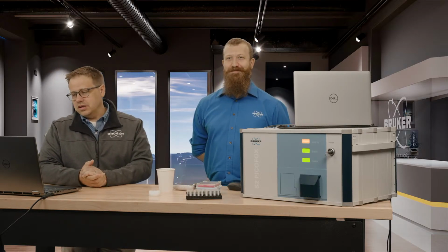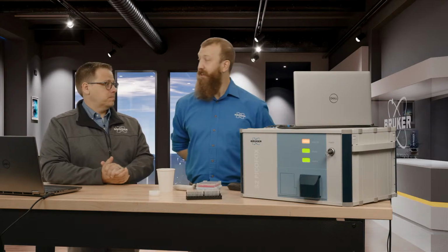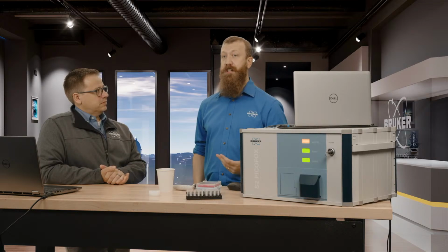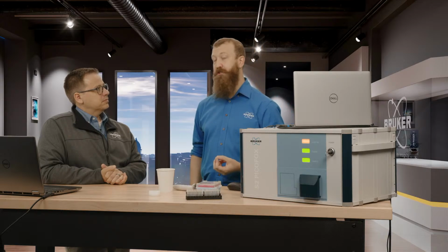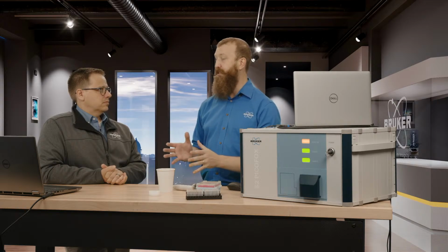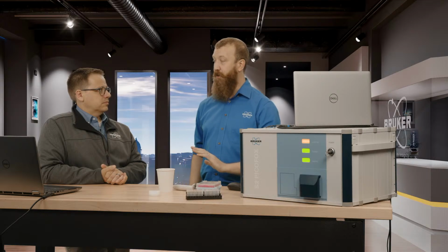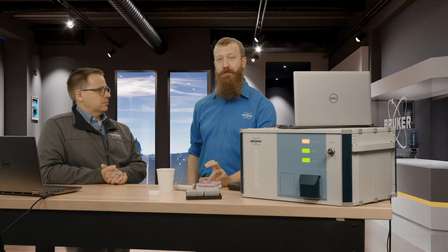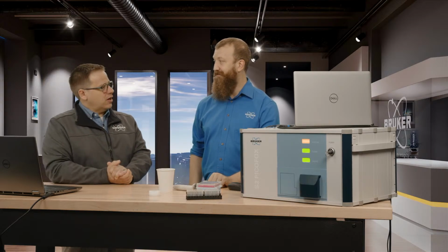All right, and then Dalton asked, can you analyze biological samples directly, or do you need digestion? That's actually a really good one. We do talk about digestion, and digestion is a sample method that I recommend. But it's not the same kind of digestion that people are used to when they think of ICP. ICP digestion involves microwave digesters or maybe HF, which is really hazardous and not pleasant to work with. For me, digestion is room temperature. You take 10% nitric acid and put it in with your sample. That's it.